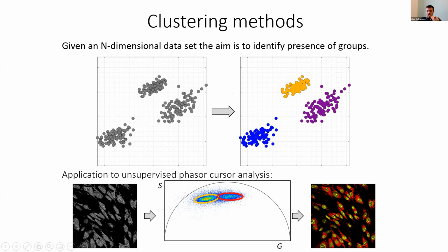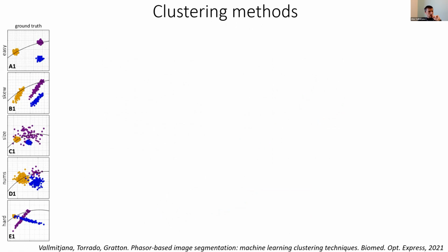So we started to develop this technique early on, I'd say just before the pandemic. And so it's a computational work, so we could do it from home. It's based on simulated data at the beginning, and then with Belen, we prepared some samples to test it, but everything was done offline at the beginning. So here we prepared some simulated data. This is what we call the ground truth. The ground truth is like you cook your data and you have it ready and you know exactly for each of the points what cluster it belongs to.